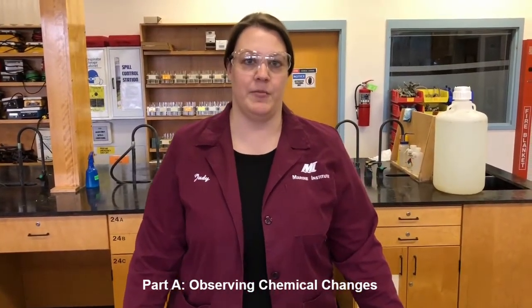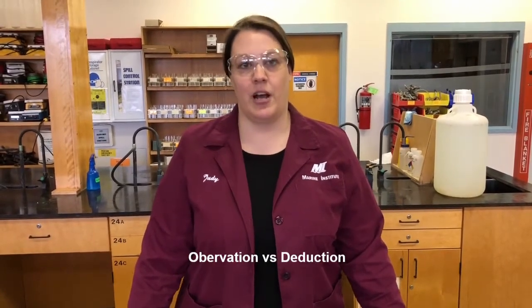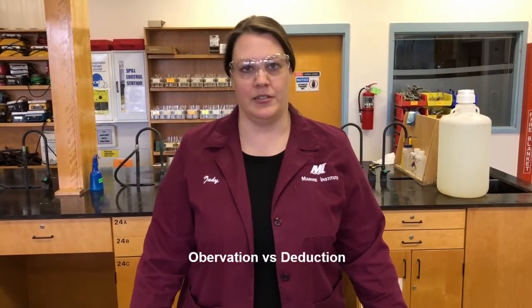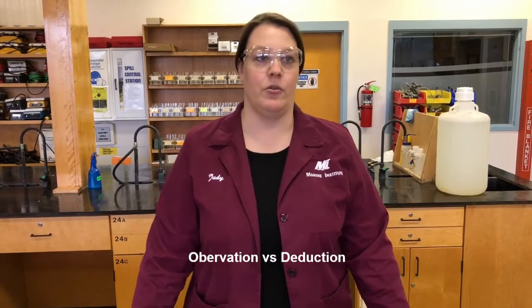The main goal of this part of the experiment is to show you the difference between an observation and a deduction. An observation in a chemistry lab is exactly as it sounds: it's what you see happening, what you observe. If you see a color change or bubbles being produced, if you feel heat being produced, if you can smell an odor, those are all observations. Based on your observations, you reach a deduction. A deduction is what you can deduce or conclude based on your observations.